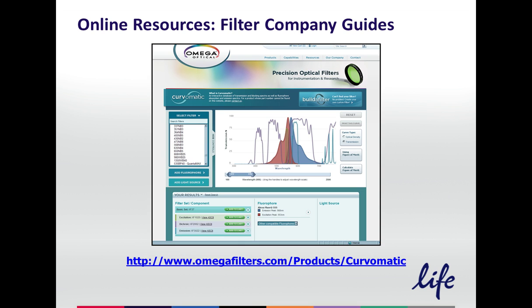Another good resource often can be found at the filter companies, the companies that make the filter sets. Chroma, Omega Filters, Semrock, those are the 3 main companies. Here's a tool at the Omega Filters site called the Curvomatic. I love that name. And this is where you can call up a large number of different dyes and see their excitation emission curves. It can suggest filter sets for you, or you can overlay their filter set specs on it and see how they compare with each other. It's quite useful. But these are just a few of the online resources that can be helpful.